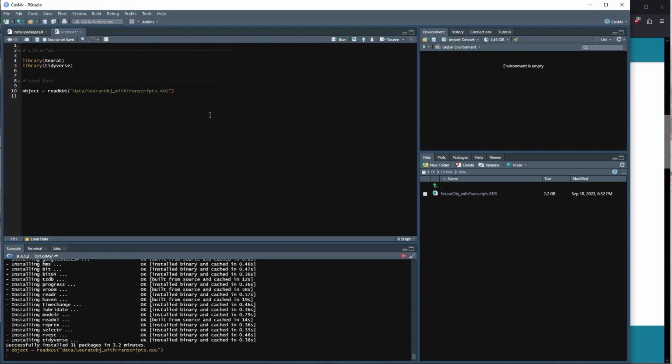So there's negative probes. And if you have too many negative probes that show up positive on your sample, then there might be too much noise to derive real information from it. So in that case, you would also throw those away. Something that their InSituType software package will do is take in those negative probes for their cells and then use that in trying to determine whether or not they're a particular phenotype. I don't know what association there would be between more negative probes for a particular phenotype or not, but it takes all that into account. And potentially it's not even a particular phenotype, it's just using that to remove extra noise.